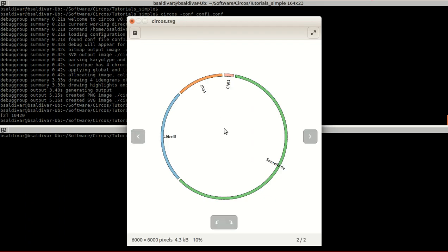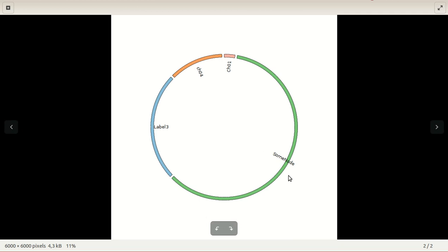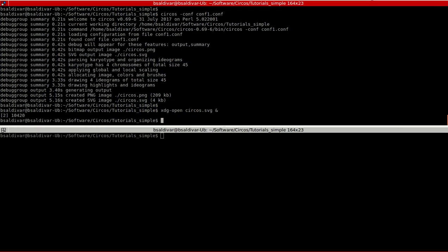We have exceeded some part of the labels, but we achieved what we wanted. So you can see that we moved the labels, and we made everything fit, and we have seen what happens when we set label parallel to false, or in this case to null. Just one last modification to make this look better, and we're done with this.